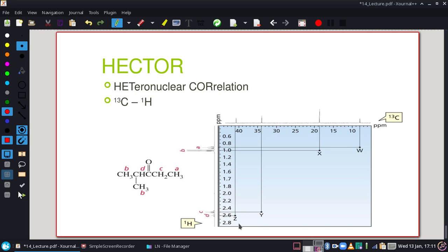Now these last three techniques are really done for much, much bigger molecules, and while we will talk about them and such, we're really not going to analyze the data on these. And if we were to have that spin solve NMR in our lab, those techniques actually take half-hour runs or so. So it's not like this happens easily. These are really for much, much bigger molecules. Like this example right here, there is absolutely no need to do a HETCOR for this. You could actually get that result from just a standard carbon and proton NMR. It just would be quicker if you had a HETCOR sample.